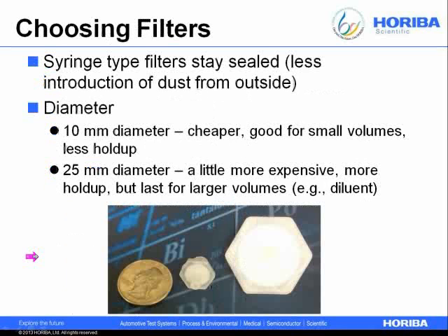I like syringe type filters and carry them around. Recommend them to everybody. They introduce less dust from the outside. So you load a syringe up with liquid, you put the filter on it, and you push the liquid through, and it drops right into your cuvette, and there's no more chance of contamination.